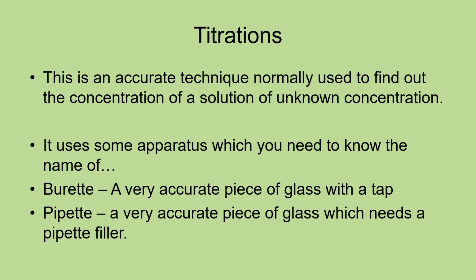So what is a titration? I want you to imagine that you've got an acid and an alkali and you know everything you need to know about one of them. So you've made, if you remember, we talked about how to make a standard solution. So using those measured flasks, the standard flasks, we add the chemical in, we dissolve it, we top it up, we add the rinsings, we did all of that before.